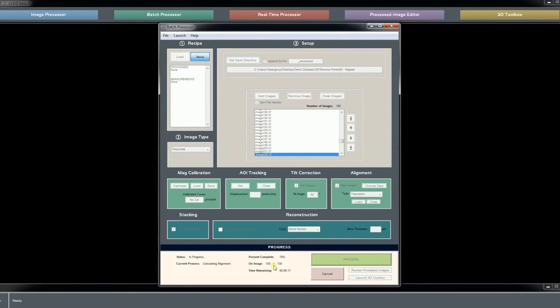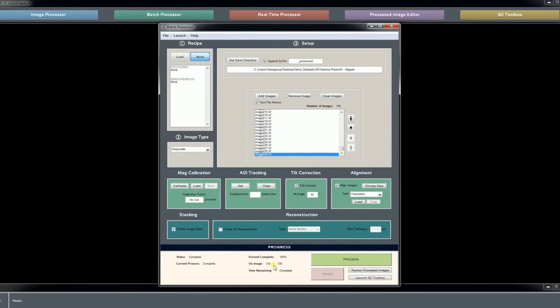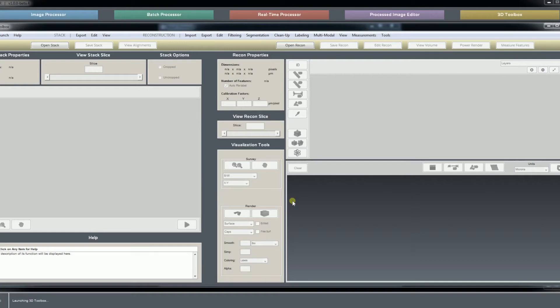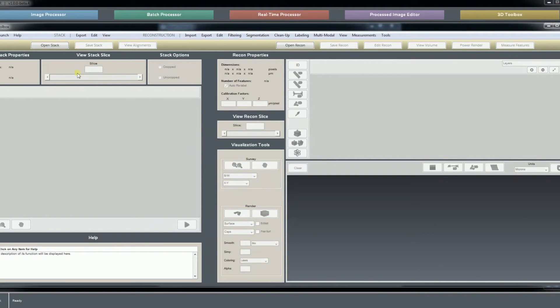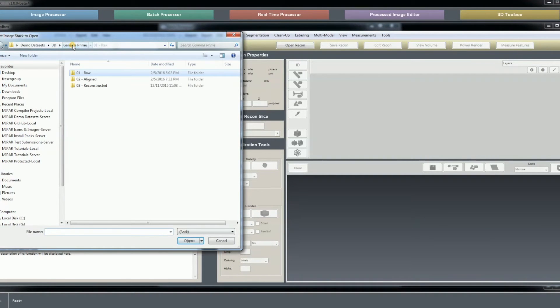Opening each image, aligning it to the previous, placing it into a MyPAR image stack file — opening the image, tilt correcting it, then aligning it, then stacking it. Now we're just saving the stack to finish. The image stack is built, so we can launch our 3D toolbox and open up the stack and take a look at how the alignment proceeded. We will open the stack.